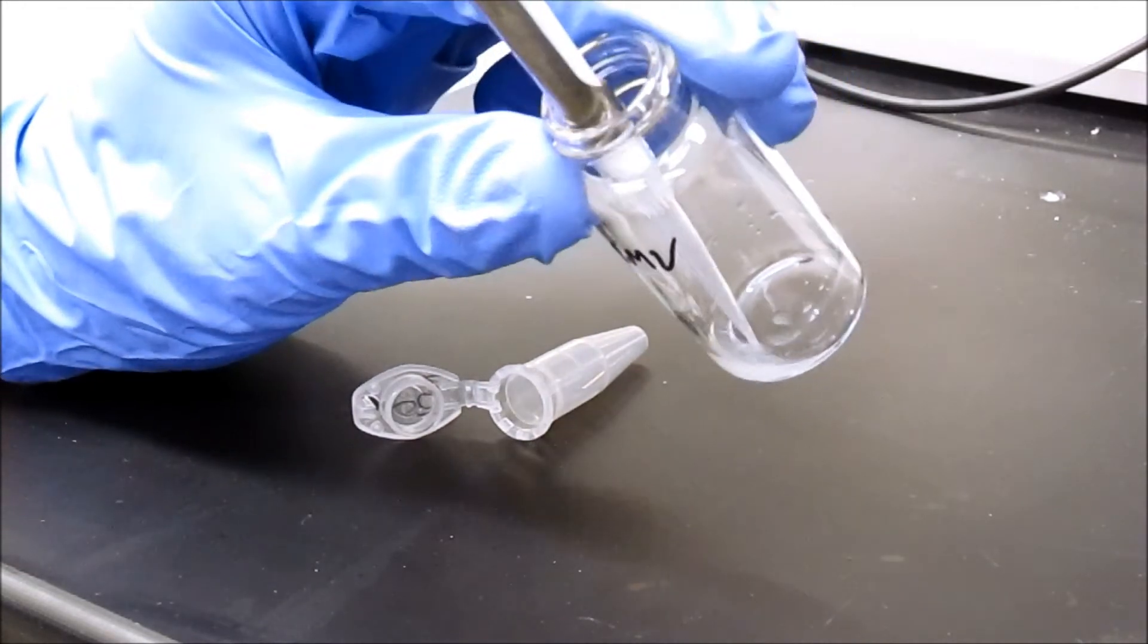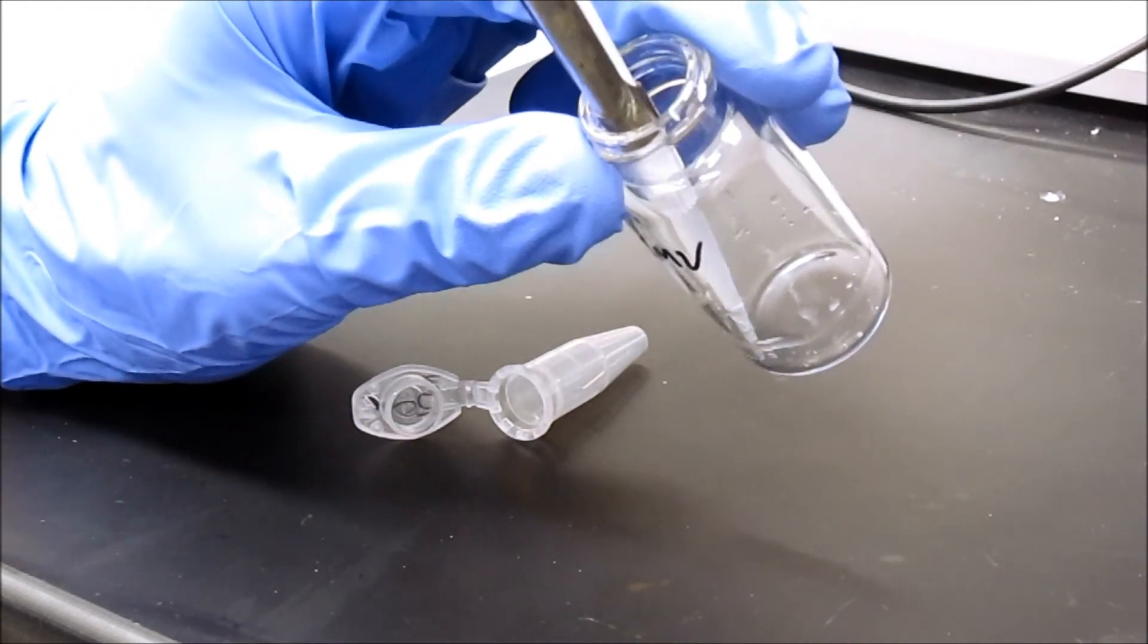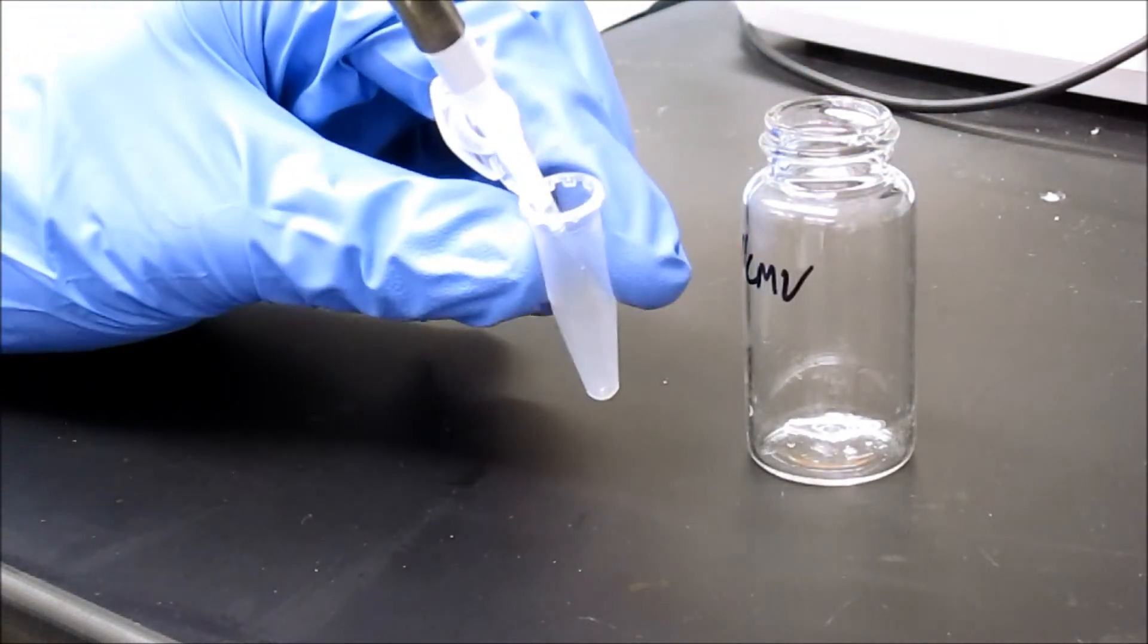Now that the liposomes have been successfully assembled, they must be removed from the vial and placed into a 1.5 milliliter Eppendorf tube.